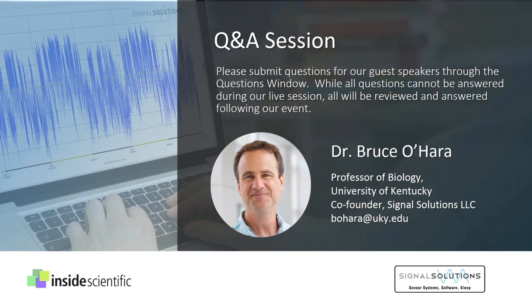So we think we can very accurately distinguish them. We've compared against EEG, EMG, and it probably is where our biggest error is, especially REM, where breathing becomes more erratic, and quiet wake is probably the toughest distinction we have. But comparing to EEG, EMG, we think we've gotten pretty good on that as well.